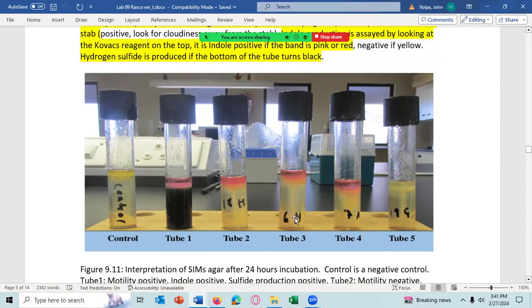And there it is there too, and there. Right there, it's there, but you see, right there, we can see the growth is only in this tube and probably that tube and definitely that tube. That tube I'm having a hard time seeing. That's why I'm saying probably. There's only growth in the stab. So these bacteria are non-motile.